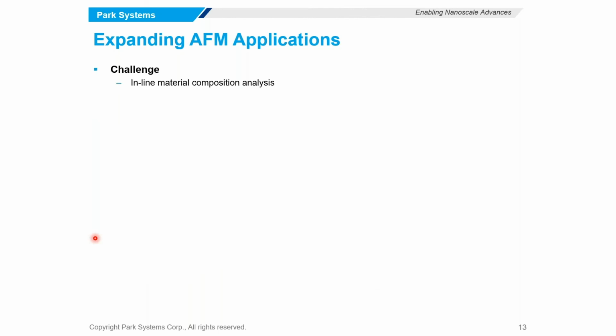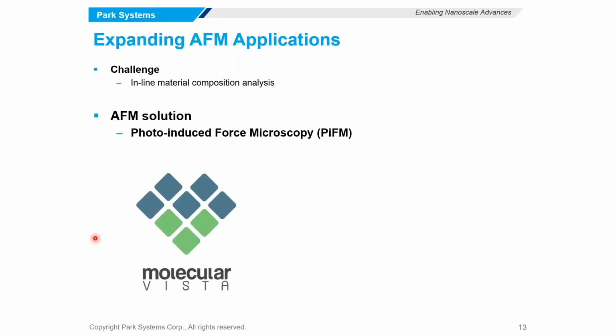Finally, and conveniently rounding back to Dr. Park's presentation, another challenge is inline material composition analysis. And for this, we have worked with our equity partner, Molecular Vista, of which Dr. Sung Park is a founder, to have a photo-induced force microscopy unit in addition to our existing AFM platform.